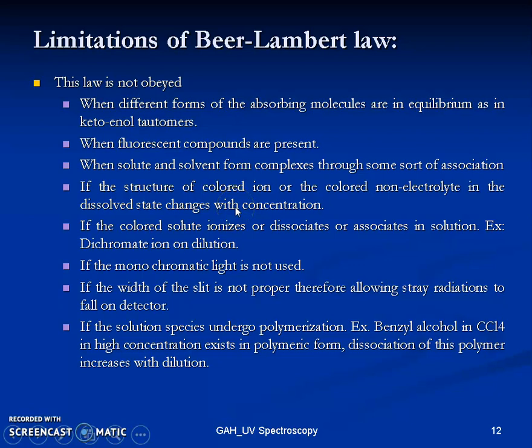If the concentration is higher, the color of the same compound will be different, and if the concentration of the same compound is very low, then the color is different. So the structure of the colored ion is very much dependent on the dissolved state, and if it is changing with the concentration, then Beer-Lambert's law will not be applicable.